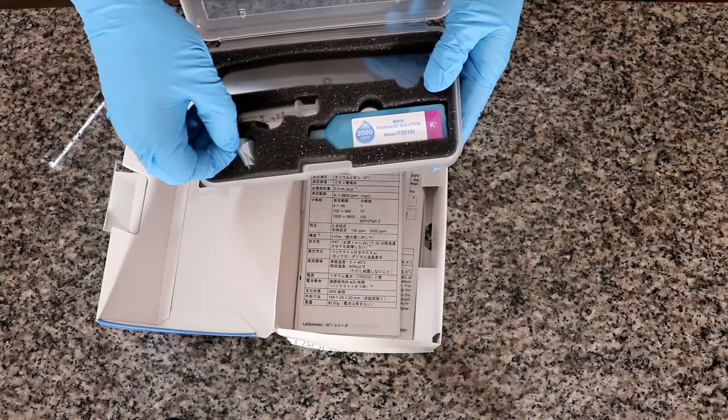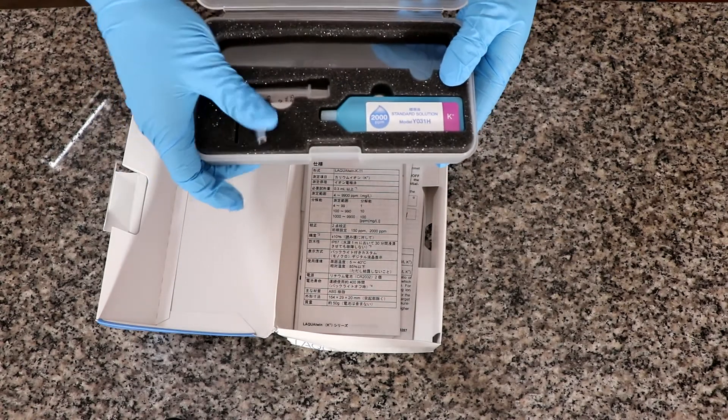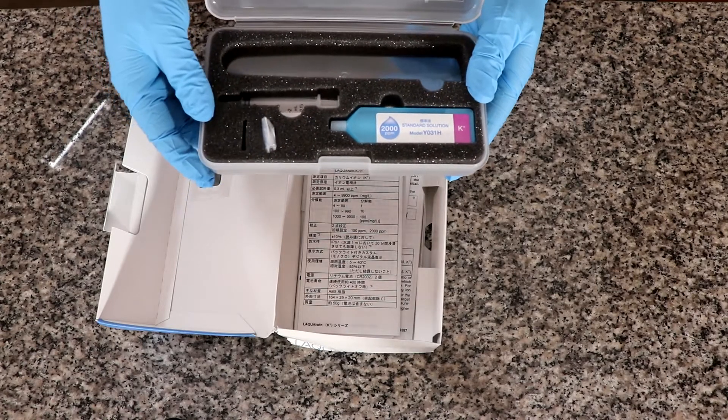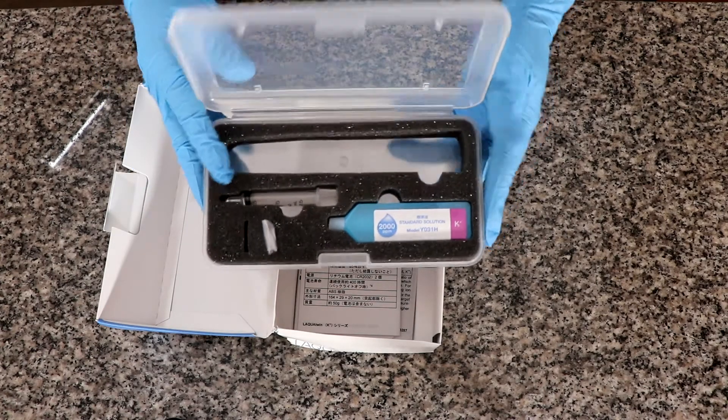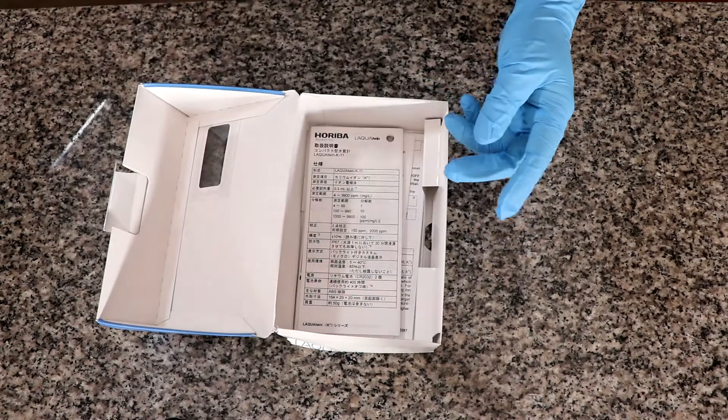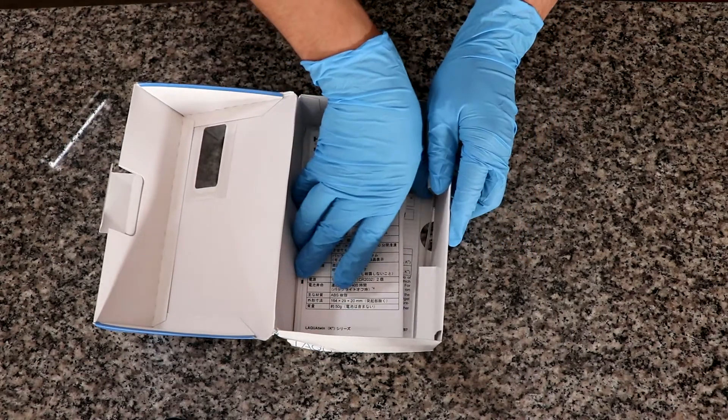We also have this small sample holder that we can use for samples that are of too little volume, like when you do sap analysis or things like that.